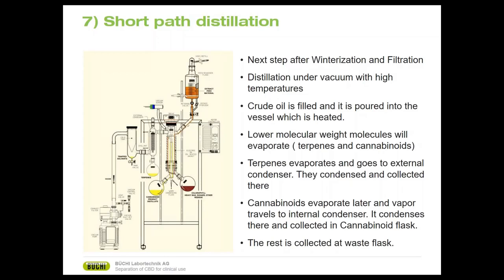So lower molecular weight molecules will evaporate. Terpenes evaporate and go to the external condenser. They are condensed and collected there. Afterwards, the temperature of the heater is changed and the remaining oil is fed to the system. Cannabinoids evaporate second, after terpenes, and the vapor travels into the internal condenser. It condenses there and is collected into the cannabinoid flask. The rest is collected in the waste flask. This is called falling film evaporation.